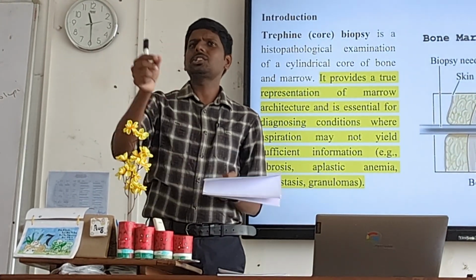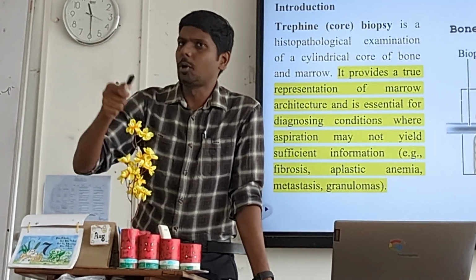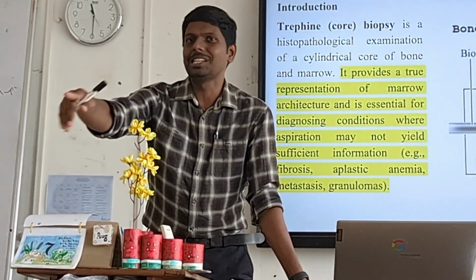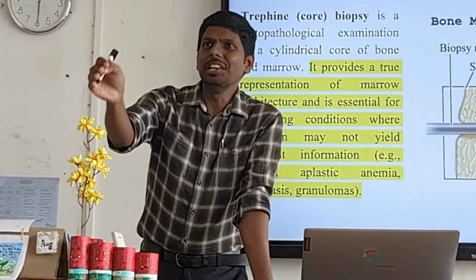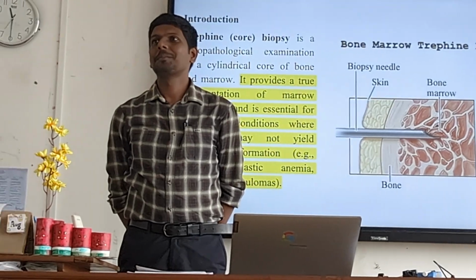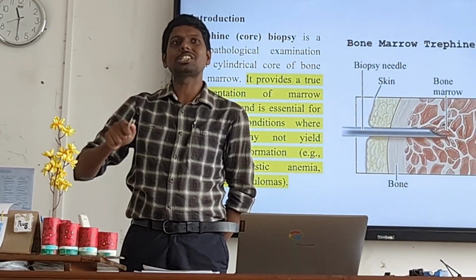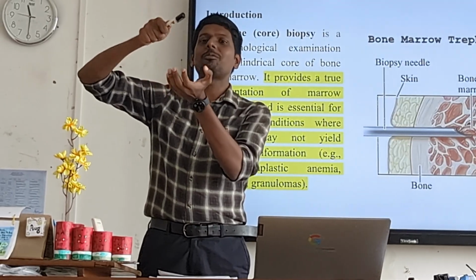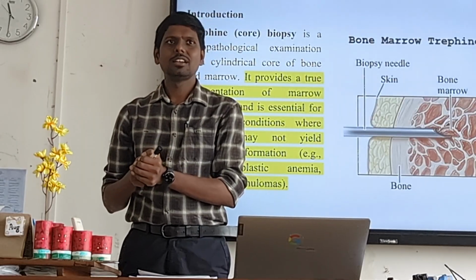First, I requested you to cut the potato. Are you able to cut it? You can cut a very thin potato slice. Now, I need the same slice thickness from your cake. Can you cut your cake as thin as your potato slice with the sharpest knife in this universe? You can't, right? What is the problem? Why can't you cut the cake into the thinnest slice? Because the cake is very fluffy. Even though the knife is sharp, when we touch it, the cake will squeeze, right?